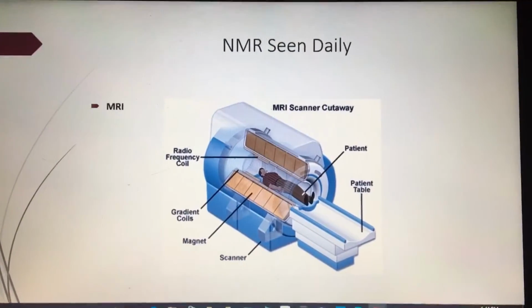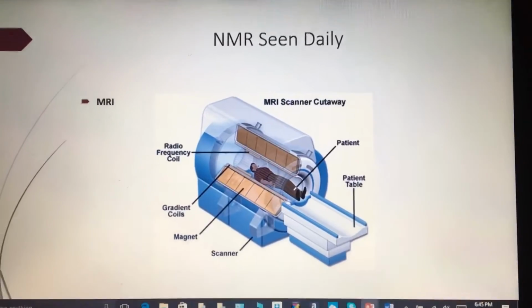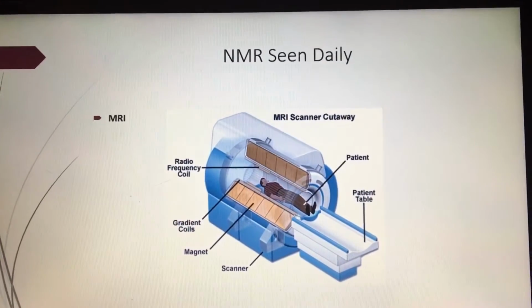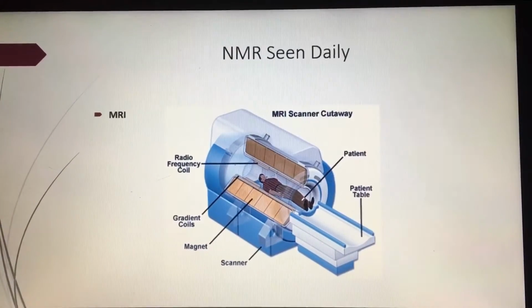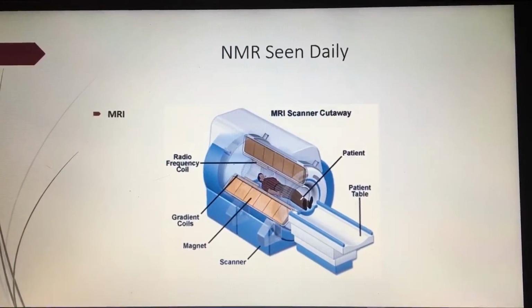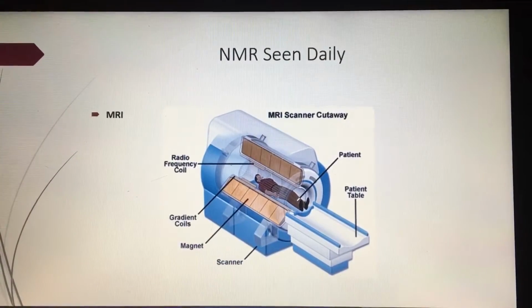When thinking about NMR, one does not think of all the everyday applications that NMR goes into. Almost everyone has had an accident. You fall off a tree, you break your arm, you hurt your leg, you end up going to the doctors, and they put you in an MRI machine. An MRI machine does the same thing that an NMR machine happens to do.